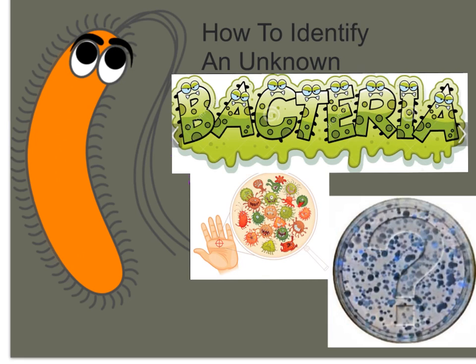Keep in mind that as you develop this protocol, you need to do as few of the microbiology tests as possible in order to identify the bacteria. Some professors will even put a limit on the test. So we will review how to pick the correct test, which tests to avoid, and which tests are good solid tests to run.